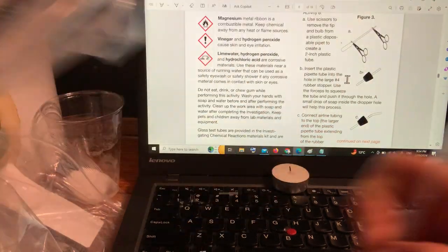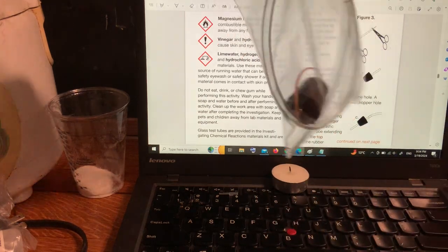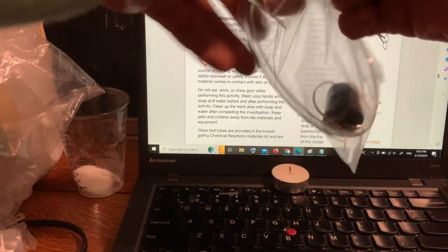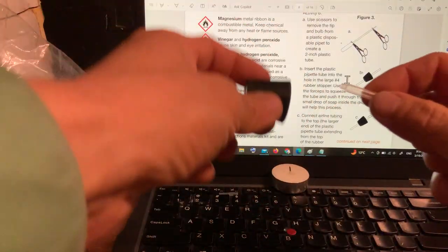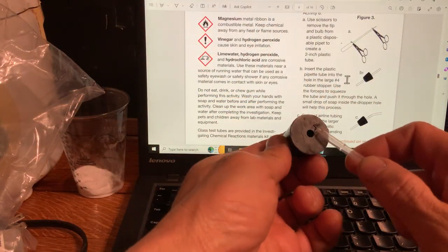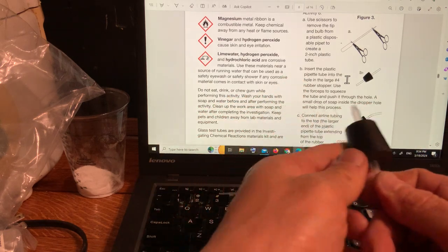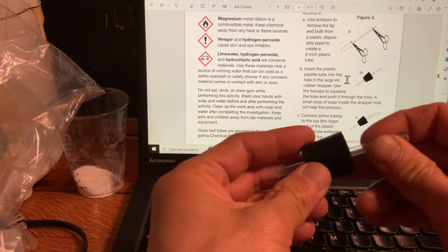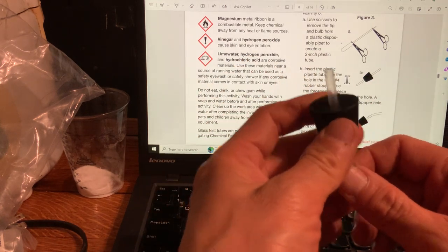Is this it? No, where's the stopper? This is it, this is a stopper. The big stopper, okay? Like that. Okay. This is a number 4 stopper. See? Number 4. Stick that in there. It says use forceps, but you don't need no stinking forceps. You could use forceps if you want.